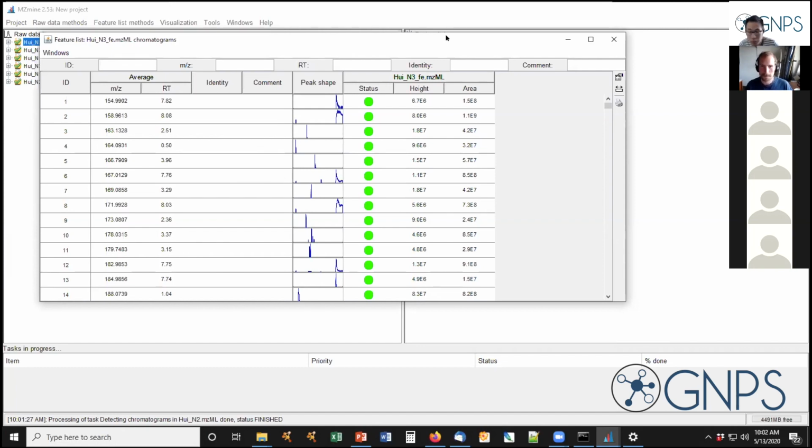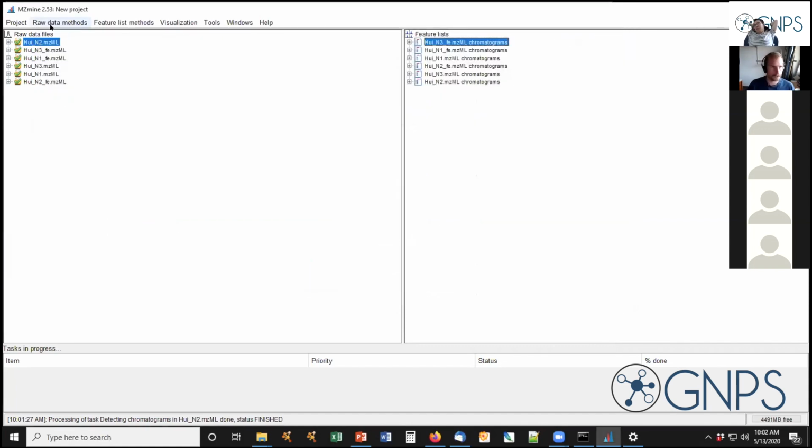And then how do we determine the minimum group size in the number of scans? Yeah, again, that's a very good question.